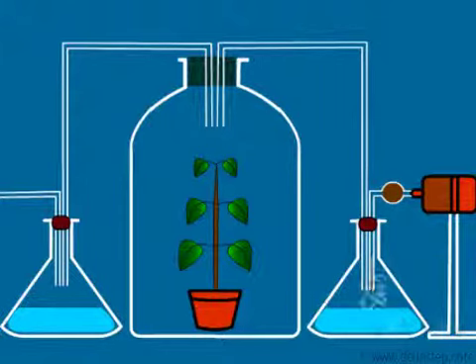Now to test if this air that is coming out of the solid soda lime is free of carbon dioxide, this air is bubbled through lime water. Now lime water generally turns milky if there is carbon dioxide in the air. But see, the lime water does not turn milky, and hence it is proved that the air is devoid of carbon dioxide, but it contains oxygen.